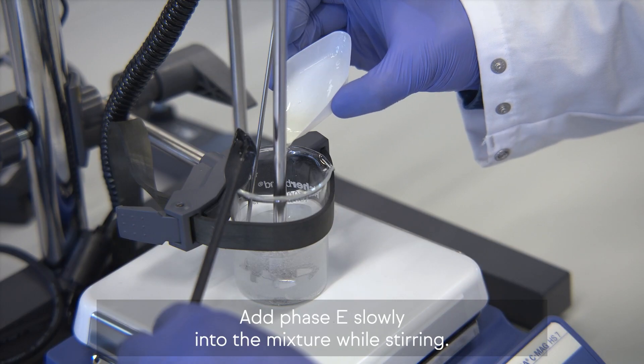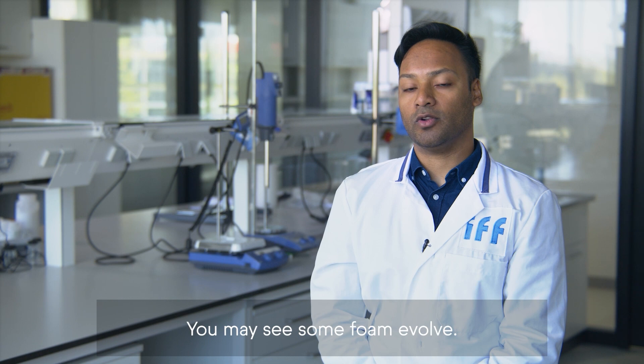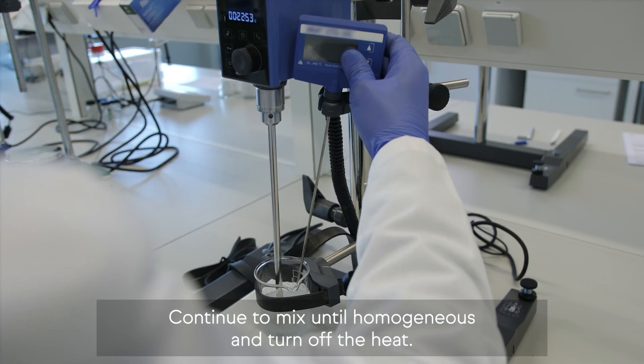Add Phase E slowly into the mixture while stirring. You may see some foam evolve — this is normal. Continue to mix until homogeneous and turn off the heat.